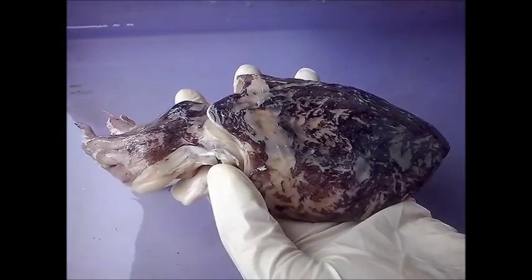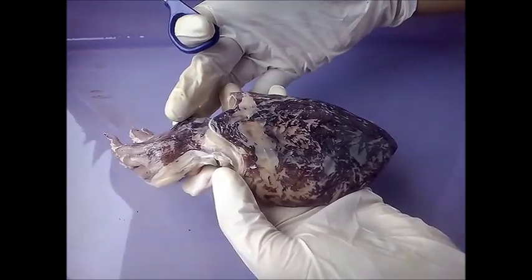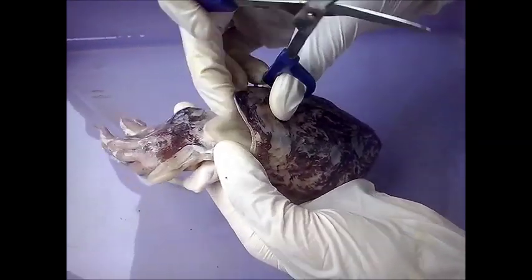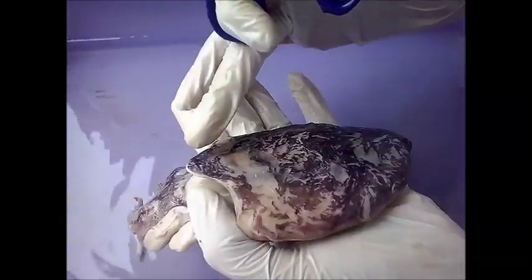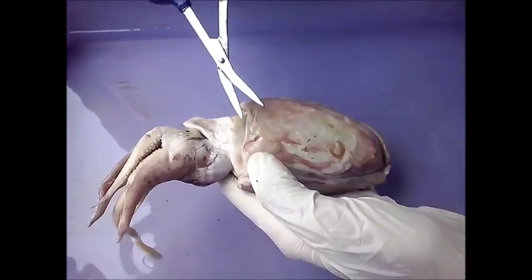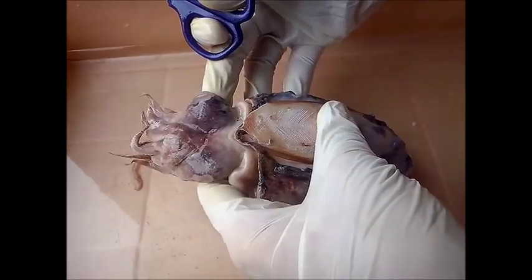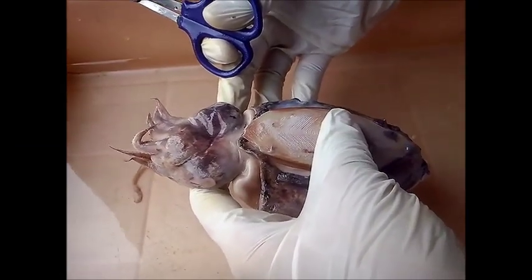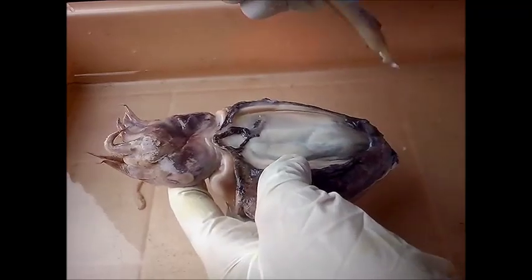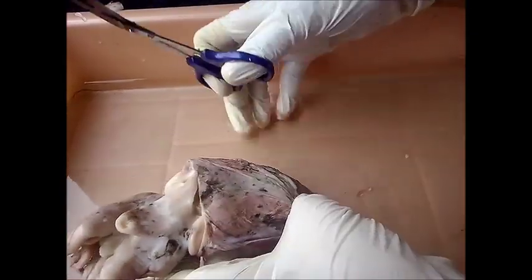In this video we shall be illustrating the reproductive system of sepia. In the previous video, we had shown the digestive system, where we made the cut from the dorsal side by removing the internal shell. In the case of the reproductive system, we shall be making a cut on the ventral side, starting from the anterior, moving towards the posterior.